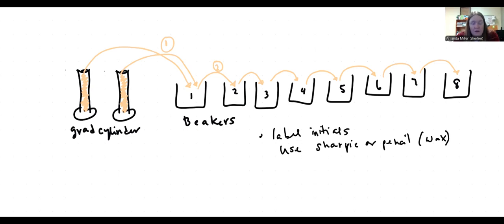This is another kind of error, so we could write a second hypothesis about it. An easy way to do that is pick a mass of iron 3 chloride that you think is reasonable to lose and just write a sentence like, it is hypothesized that, I don't know, 0.5 grams will be lost per transfer between different glassware. Okay, that would be an easily testable hypothesis here.